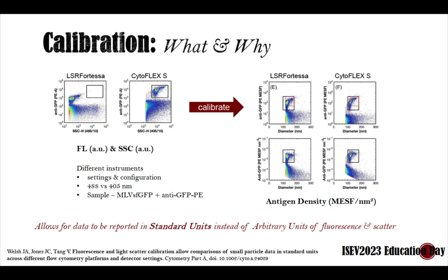Josh and I gave a workshop back in 2019 at Cyto. And it all started because we said, we want to demonstrate and show people why this is important to do. So this is, again, my favorite virus that expresses GFP, and I ran it on 2 separate instruments in my core, and we used his software, FCM Pass, to demonstrate that when you do this, it doesn't matter what settings that you're using.